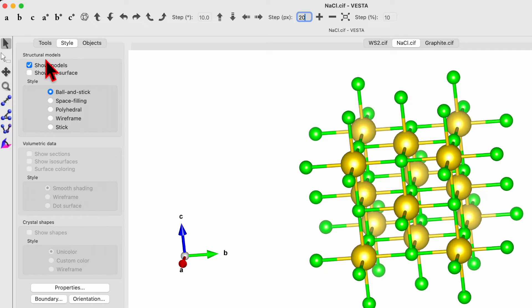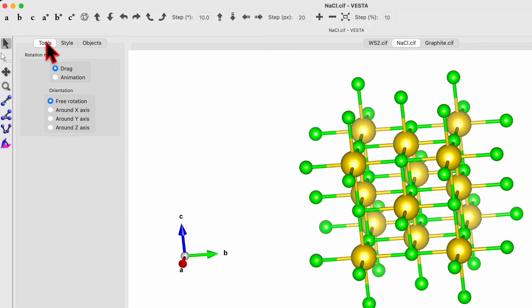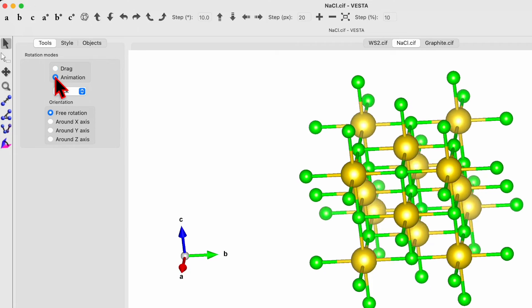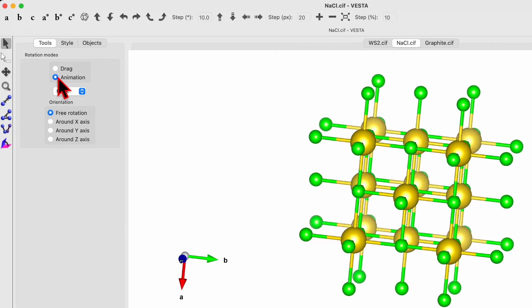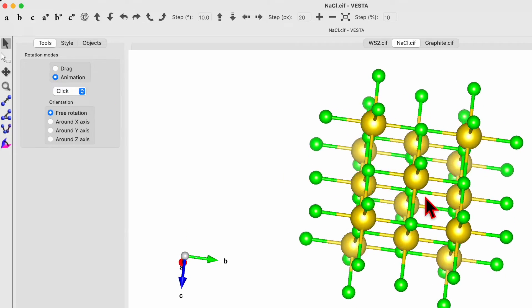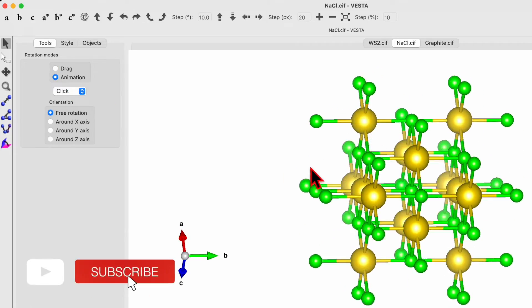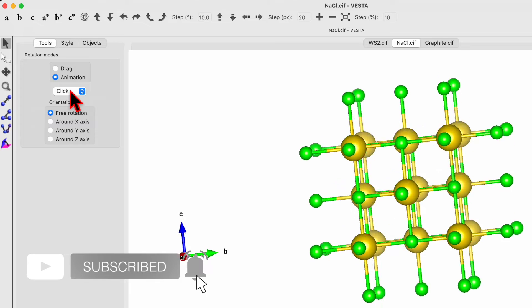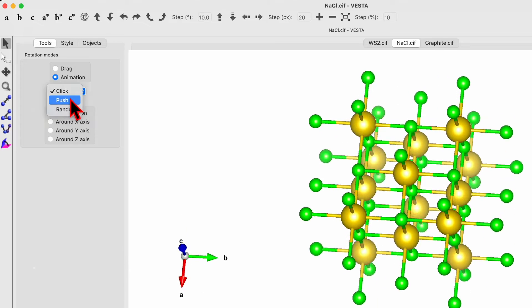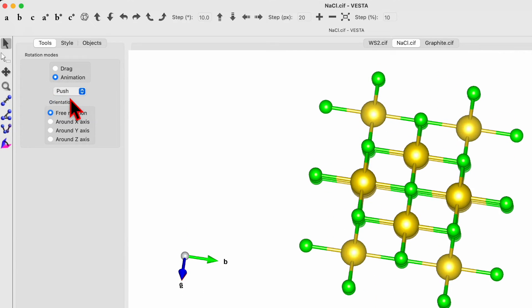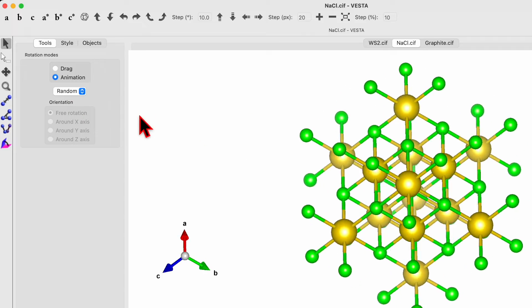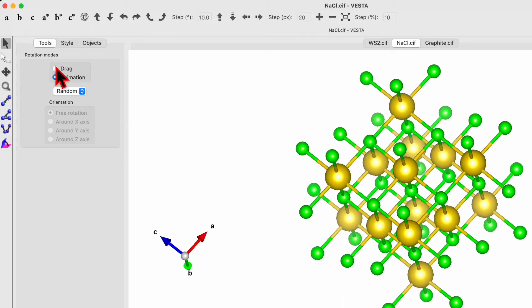Now we come to the tool menu. Over here you will see right now we have checked the box about the drag. So we can use a mouse and move the unit cell. If you choose the animation, then it will start to animate by itself. Now here you can choose the push button or you can choose the random. So that's the random animation.